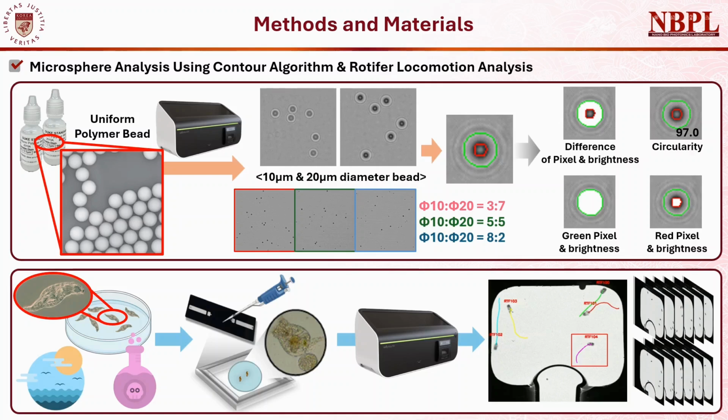And also we analyzed the locomotion of rotifers from recorded video using machine learning. Rotifers are commonly used in ecotoxicology and physiology studies. For this experiment, we used toluene and acetone as the toxic substances. In addition, various experiments were conducted based on the characteristics of cells and disease.